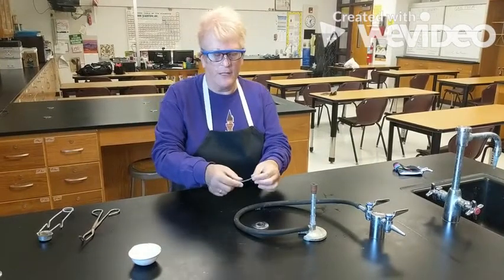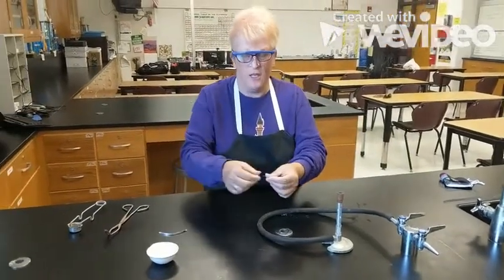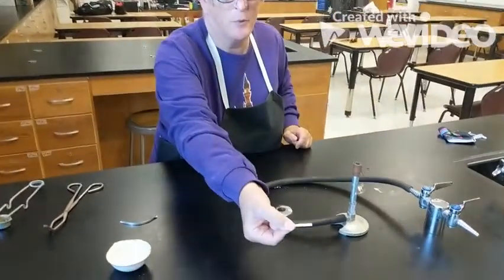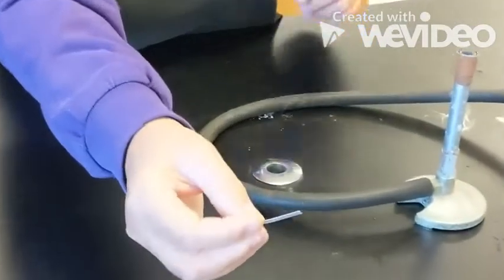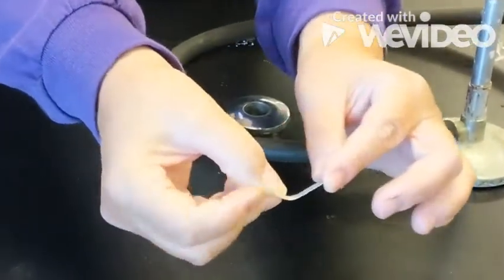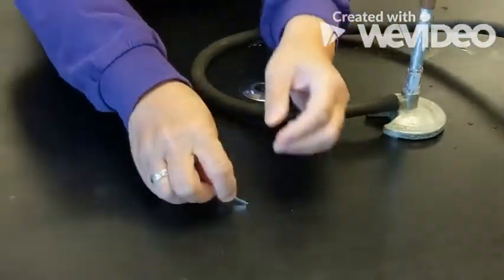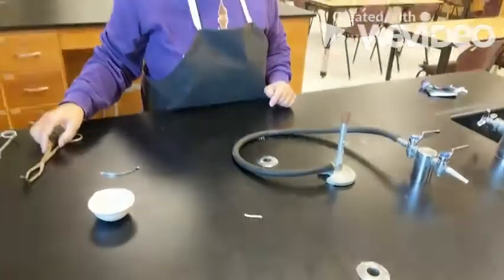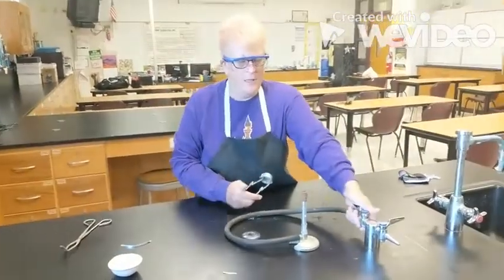Station 1, I have a piece of magnesium. So magnesium is a metal, and I just did that, so I must be super strong. So this is what the magnesium looks like. I also can bend it, so that's an interesting property. So there's the magnesium. And I have a Bunsen burner, so I'm going to light the Bunsen burner.